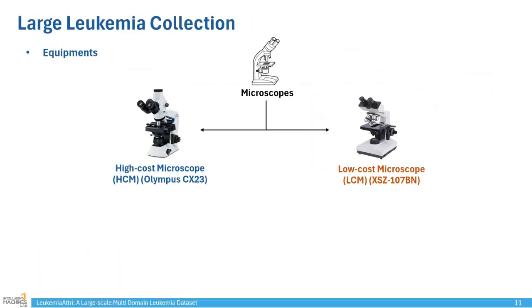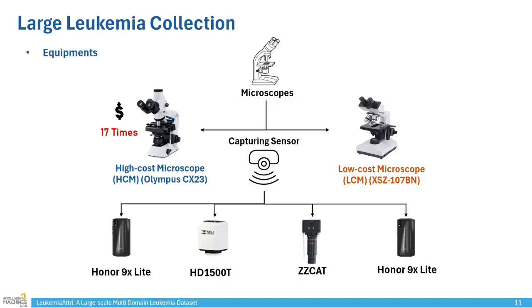For comprehensiveness, we capture the dataset using multiple options. We utilize 2 microscopes, high cost and low cost, with the high cost option being about 17 times more expensive. For image capture, we employed a mobile phone camera for both setups alongside a specialized microscopic camera.